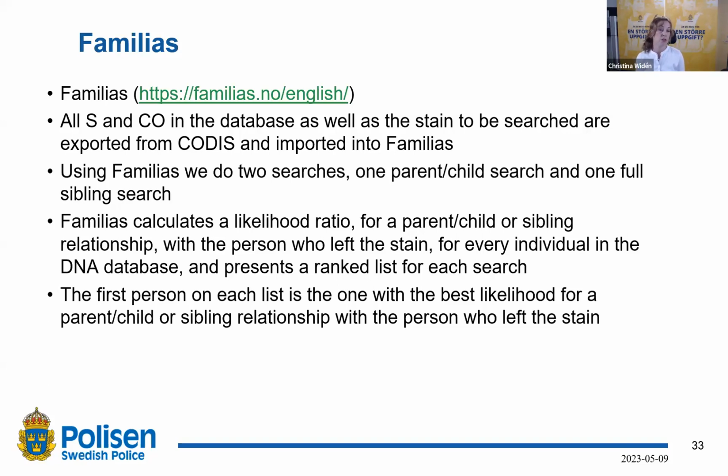And the first person on each list is the one with the best likelihood for a parent-child or sibling relationship with the person who left the stain.